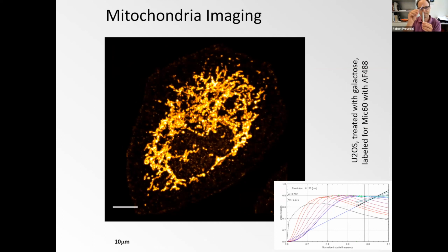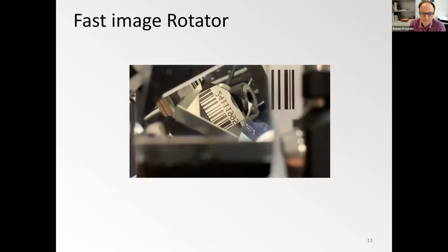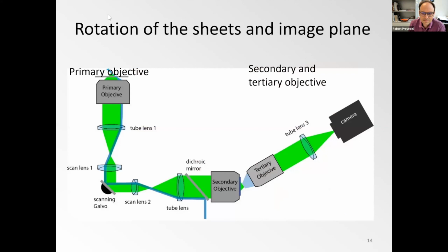I think it could probably add angular aperture. The OPM is still, even with those high NA objectives, hard-strapped in what angles it can run. So at first, without thinking too much about it, yes, it could probably open up angular space that you cannot access. Whether it will make it more practical, from my side, I really like about the OPM the aspect that it essentially is like an epi-fluorescence microscope.